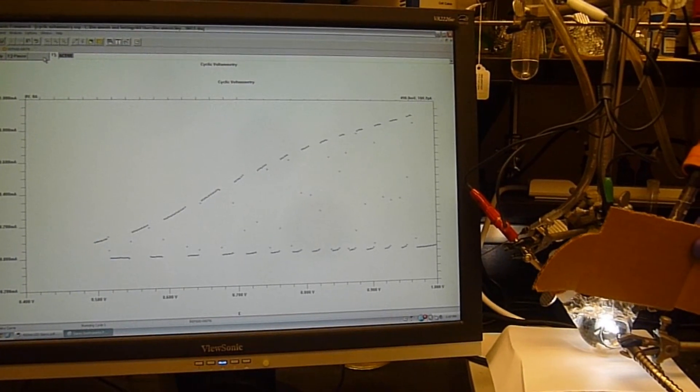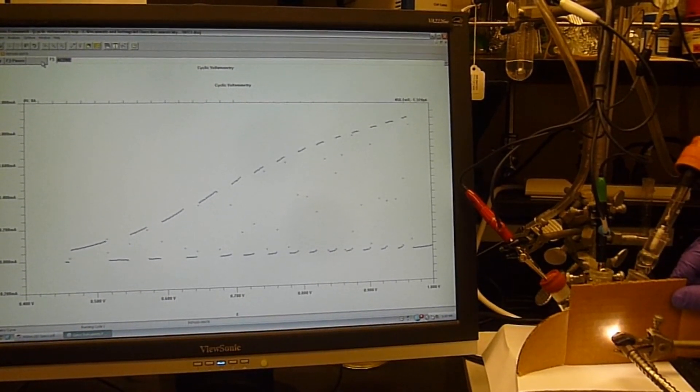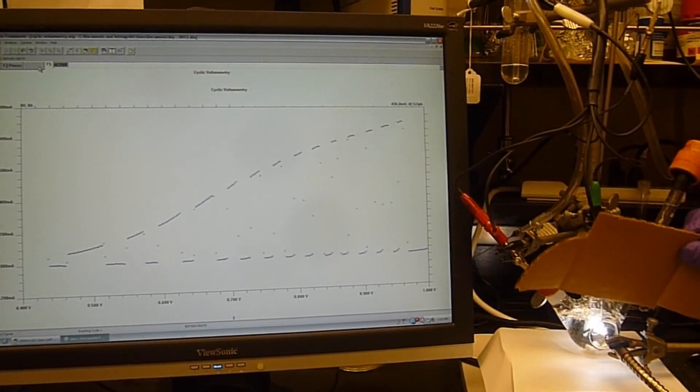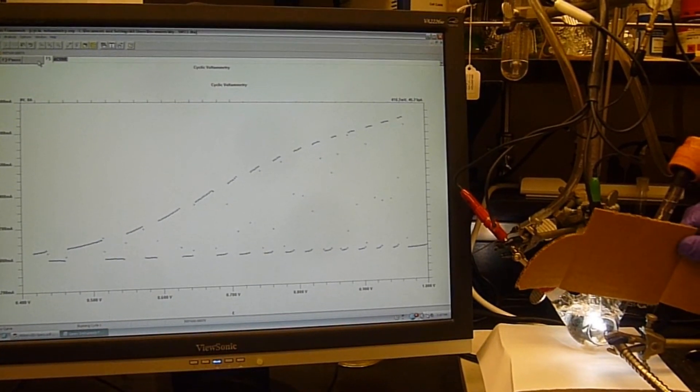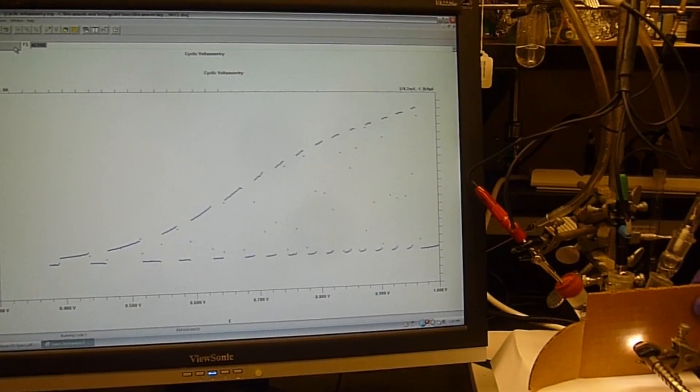This is a linear sweep voltammogram of nano-sized tungsten oxide on FTO substrate with a chopped xenon light source. You see the anodic photocurrent. It has a positive current measurement when the light is irradiated on the film.